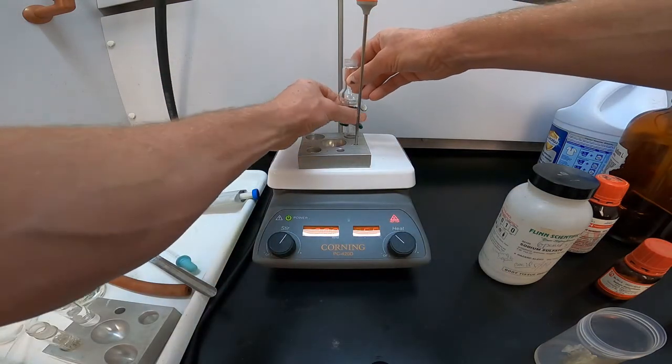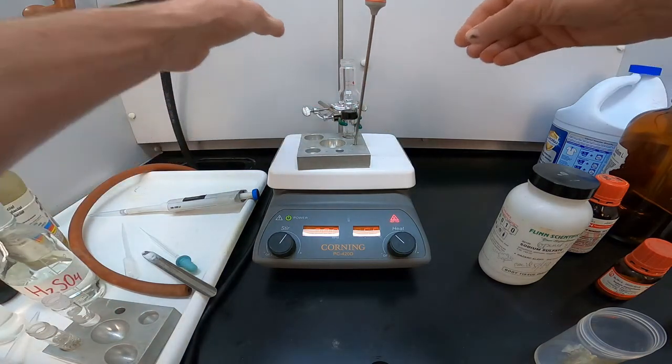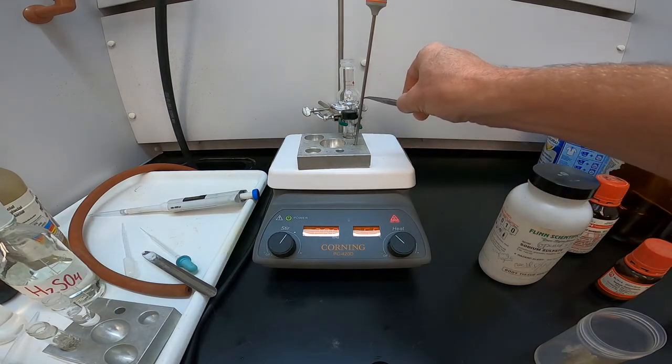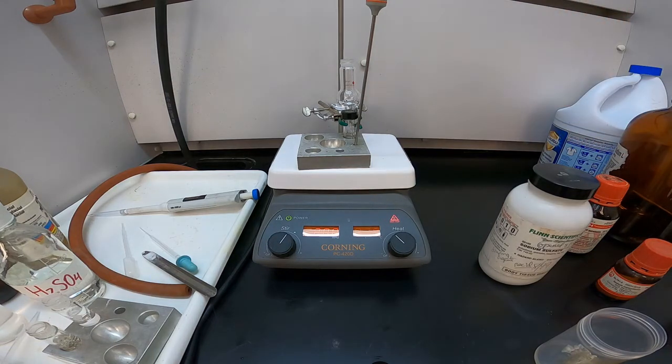Screw it on there. And as that warms up, I'm going to set it up with another thermometer in the center. And when I come back, as the distillation is proceeding, I'll explain how we can also measure the boiling point as the reaction proceeds. So if you look at the diagram in the picture that I'm going to show separately, the side of the distillation head has a curved lip on the bottom of it down here. So as the liquid evaporates and condenses and collects into that little rim, that's where we actually collect the product.